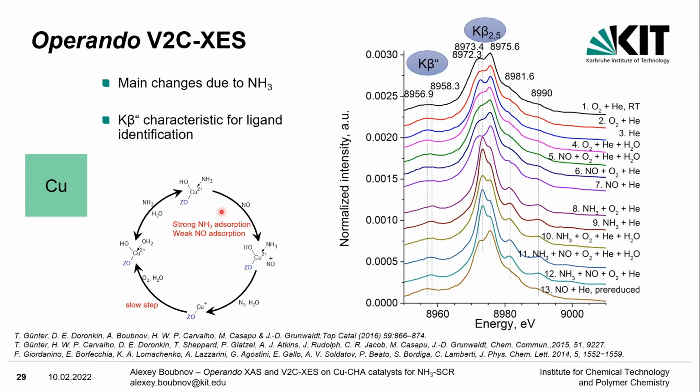Yeah, I think that's also why I was asking the question. If you just had an adsorbed ammonia on copper, then I was thinking, okay, can it lead to such kinds of spectral shifts, or is it really a strong interaction between ammonia, which in that case can also happen with copper, or really a nitrogen bonded to copper? I've seen this before, so that's what I'm asking about.